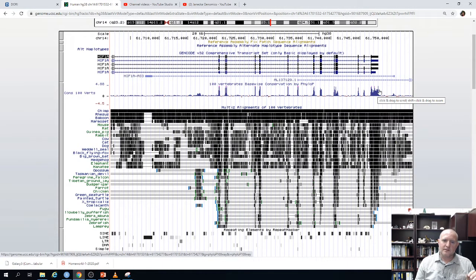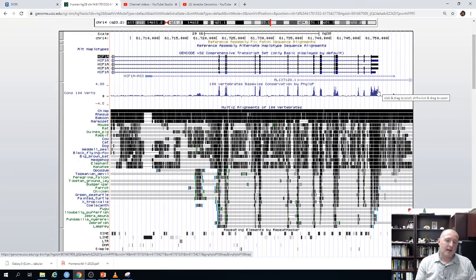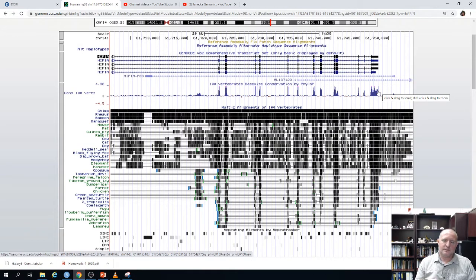However, there are parts of the untranslated regions that actually are conserved. Even within the UTRs, the sequence tends to be more conserved than introns, because there are shorter sequences in those untranslated regions that are really critical for function — probably regulation and expression patterns. Therefore, mutations in those areas are not tolerated very much.